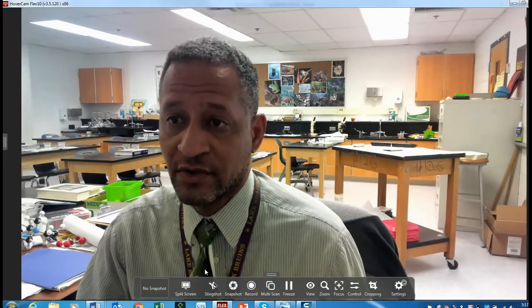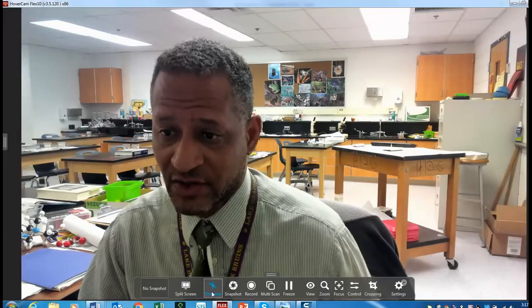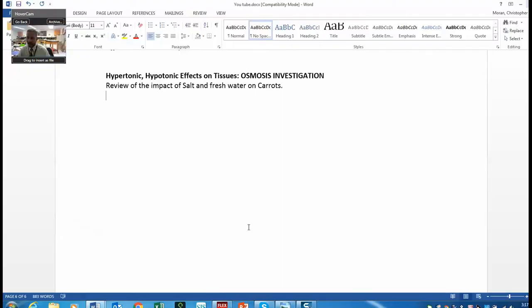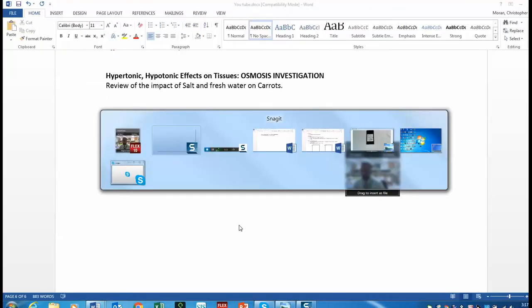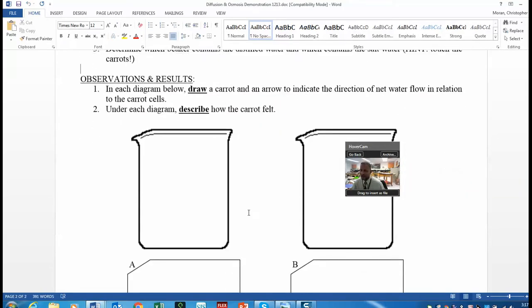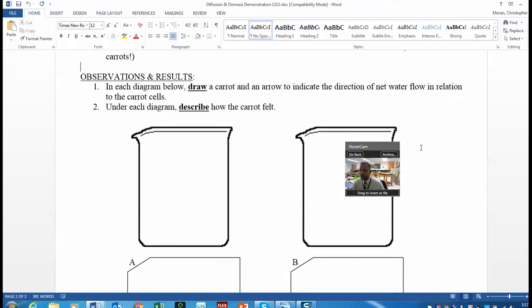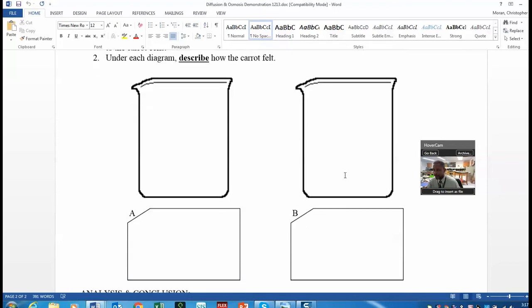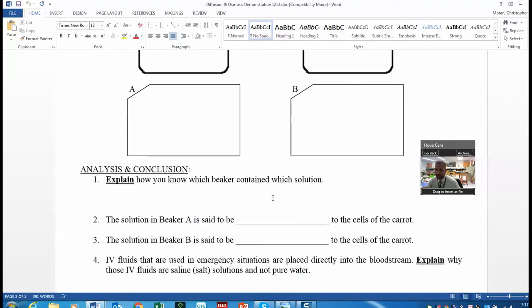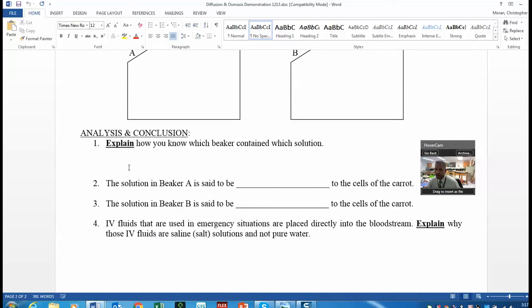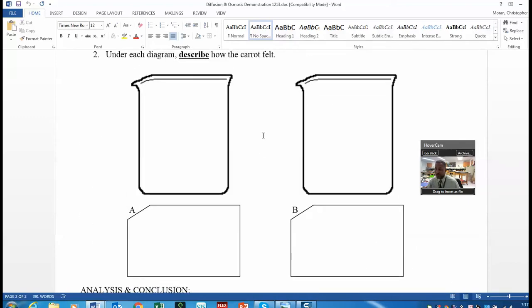My students did two labs: one with dialysis tubing and this one with carrots. In the video, you're going to see us set it up, placing carrots in a solution labeled A and one labeled B. Then we'll come back and look at the results, discuss this table, and label what's hypertonic, what's hypotonic, and what happened to the carrot in each solution.